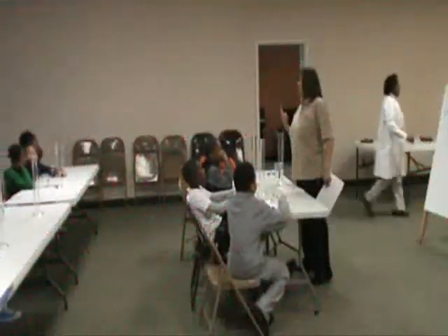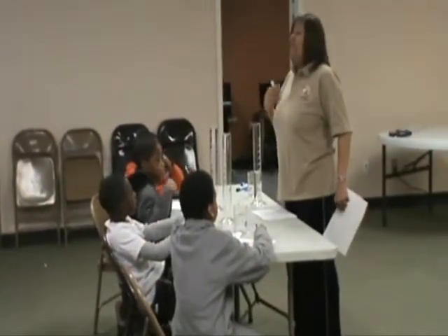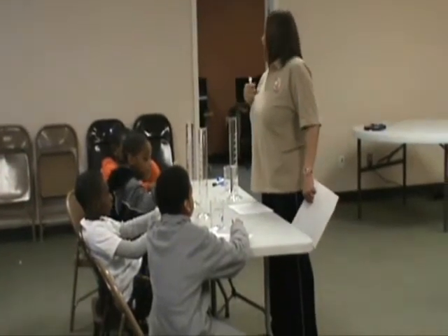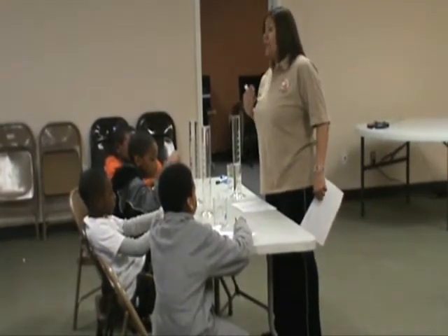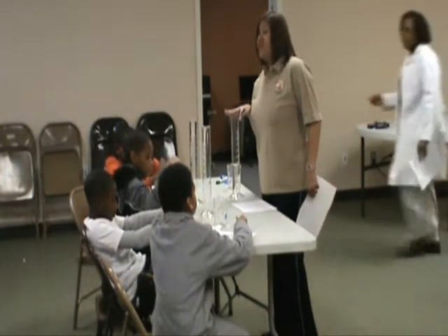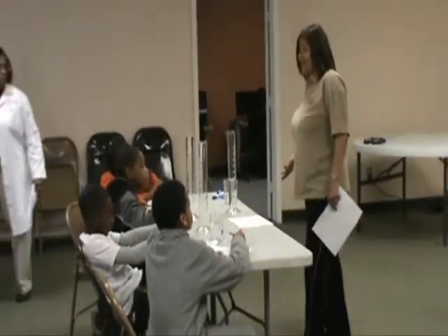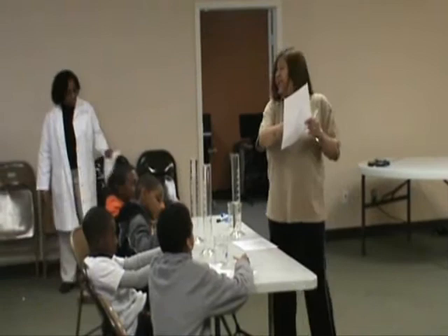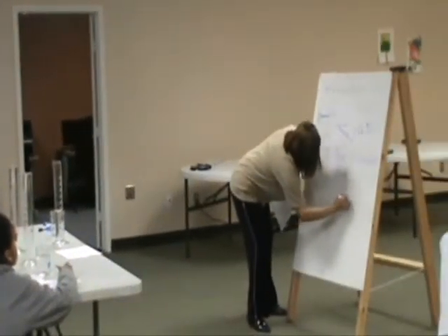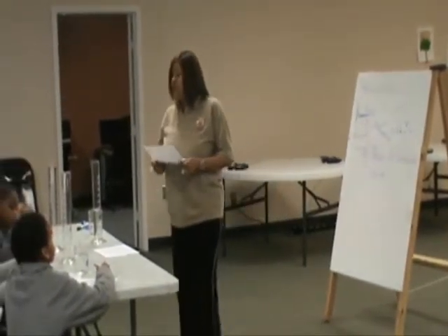Two measuring devices will allow us to get two pieces of data from today's experiment. Data is the actual information that comes from our instruments. What comes from the graduated cylinder is a volume. What comes from the balance over here is mass. So if you look at your formula, density is mass over volume, and you look on the board, density is mass over volume. You will have to supply those two numbers.